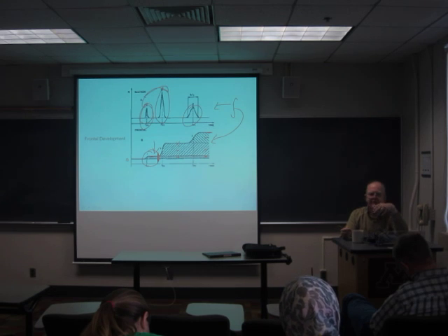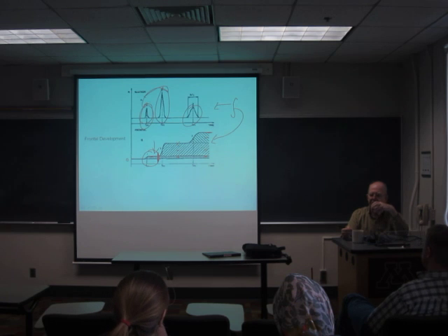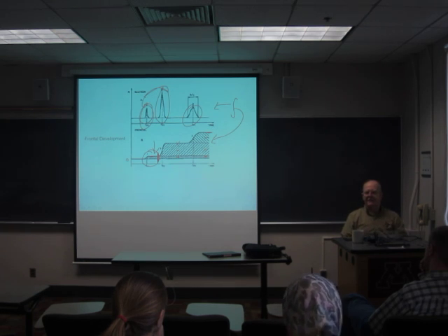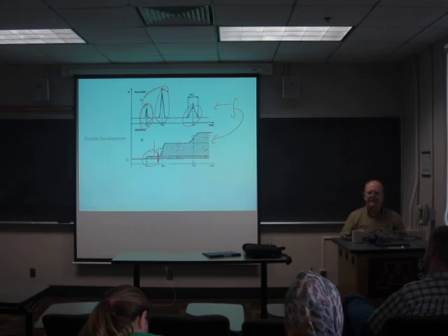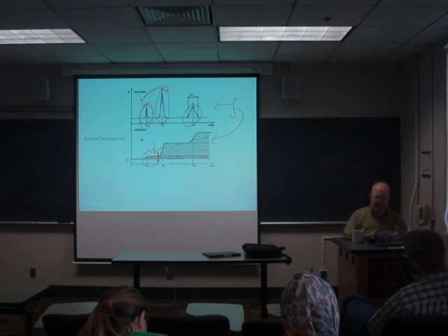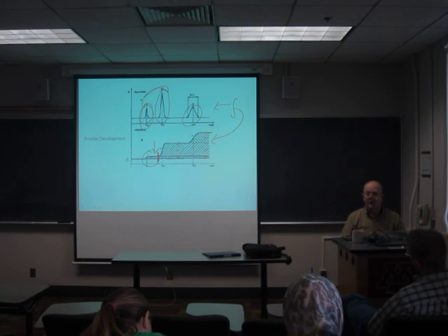Frontal development is also very useful for understanding the details of what's going on in terms of the equilibria inside the column. And we may get back to this issue later on. But for instance, one thing it can do for you is tell you what is the total capacity of this column for handling sample. Elution development doesn't readily tell you that. Elution development is great for analysis. It's great for learning about peak shapes and stuff like that, but it really doesn't tell you much about how much sample you can really load on a column.